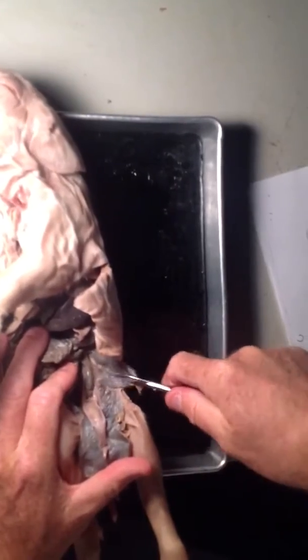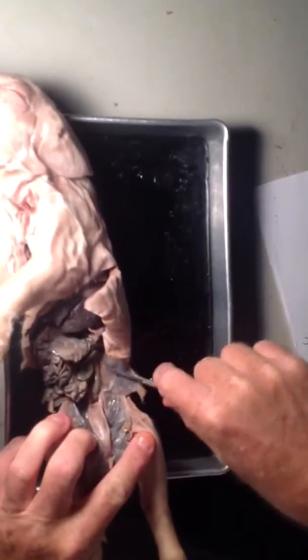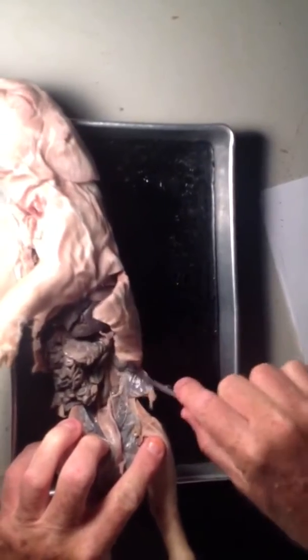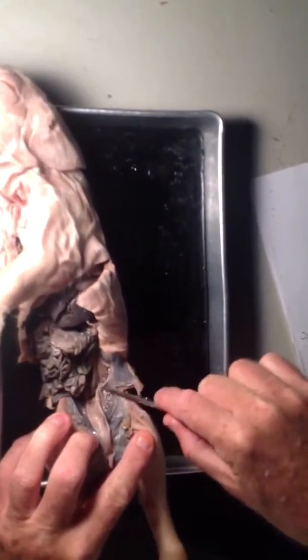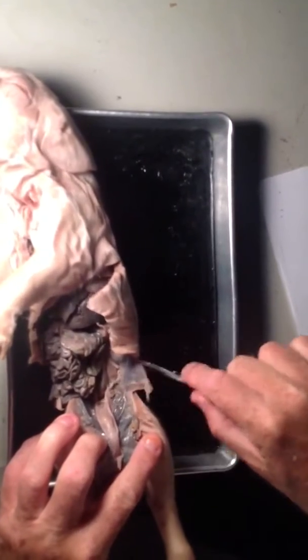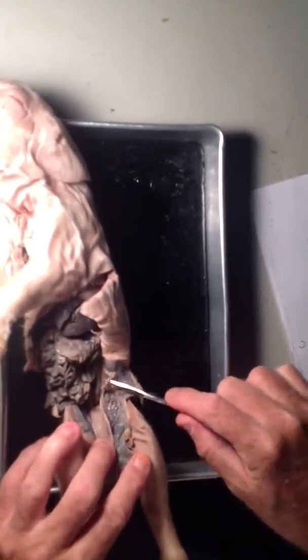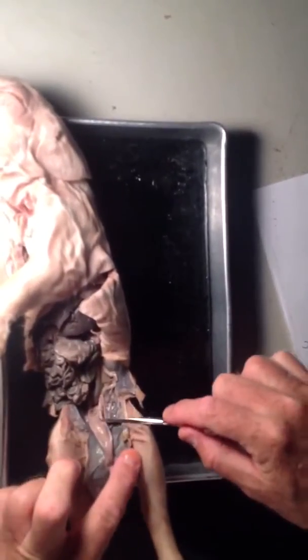There, I can see the ureter. Keep scraping it down. It really is just taking the scissors and scraping clear. If you're a little bit careful, you'll only cut the connective tissue. I can see the ureter, which goes right into the bladder right there.